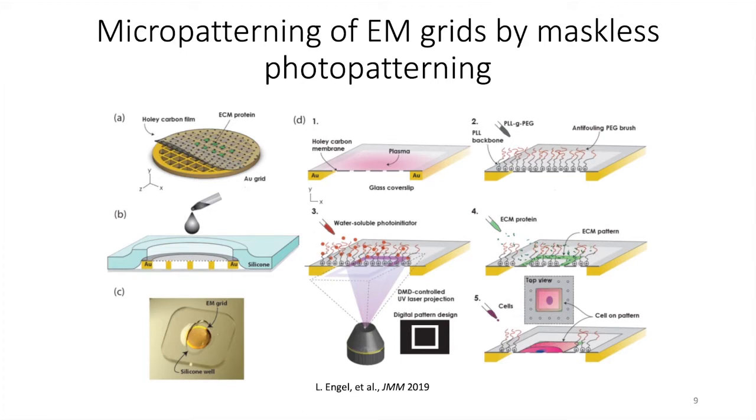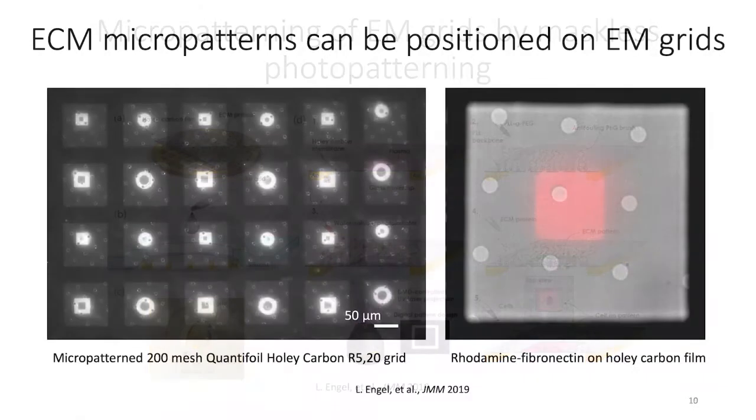Before we move on, I want to emphasize that I'm really happy to answer specific technical questions relating to this process following the presentation to ensure that you can easily replicate our results. I do think that maskless photopatterning is going to become a standard technique for people performing cryo-ET on cells and would like to help make it accessible.